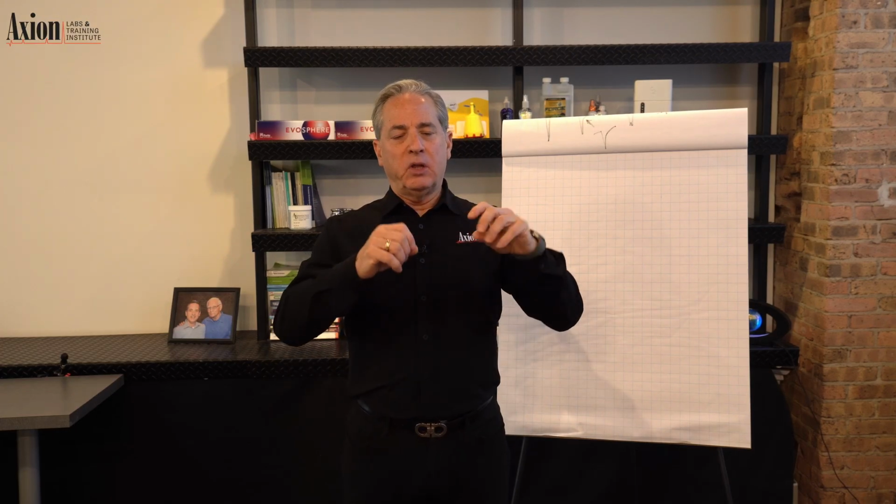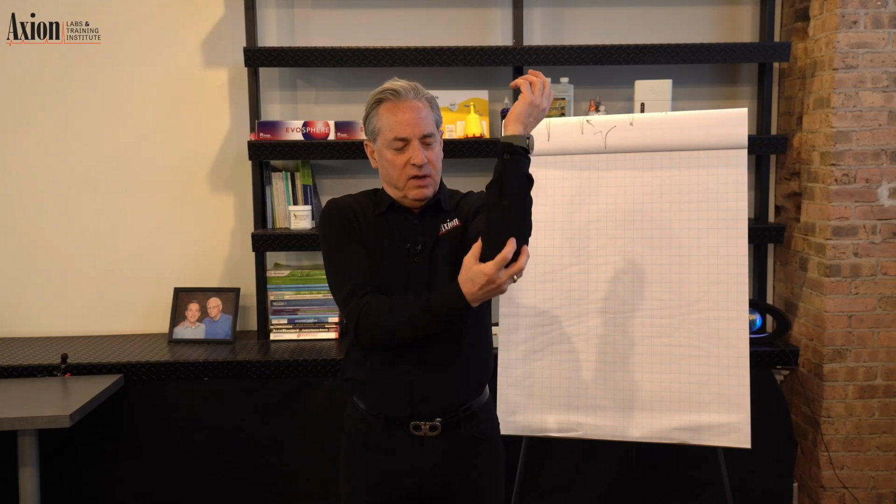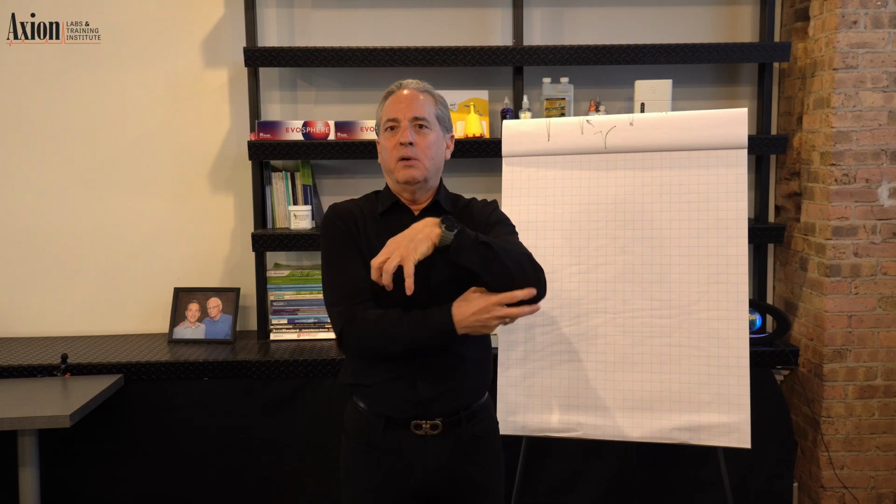If you bond a C18 onto a column, we have a normal silica, SiO, SiO, SiO silica. We put a C18 here, C18 here. Generally speaking, we can't put one in between. There's no room there. So if you do C18 chemistry, the traditional approach, you only bond half the silanols. If you can figure out how to go to those silanols in between, bidentate, where it grabs here and it grabs there, or lots of T-butyl groups in the middle, there are ways to put more carbon on the column other than just surface area.